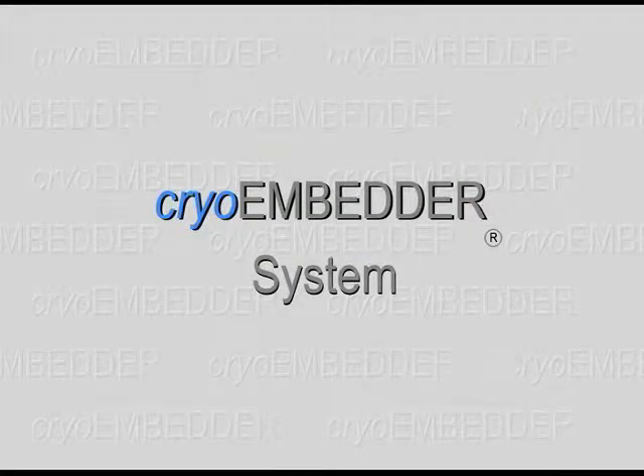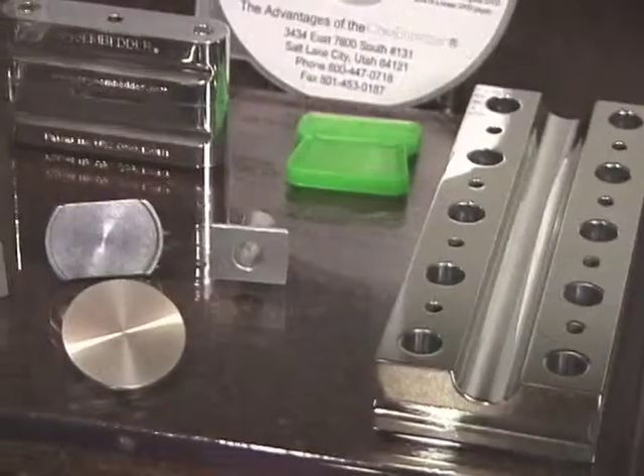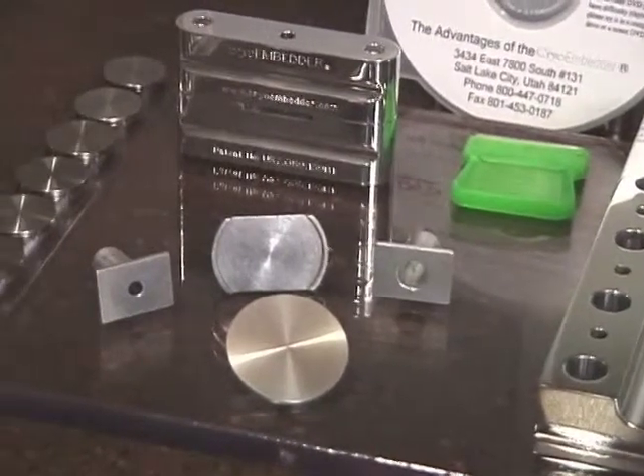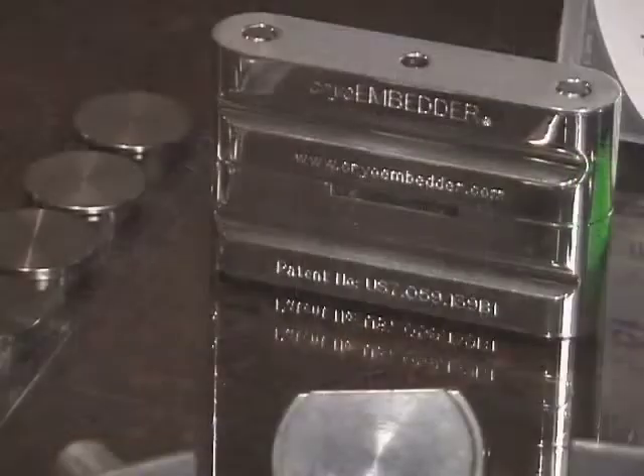The Cryo-Embedder System — a tested and proven method for preparing tissue for frozen sectioning. It consists of a cutting board, chuck holder, cryostat adapters, a trimming blade, flat embedding discs, an instructional CD, and the embedding device.